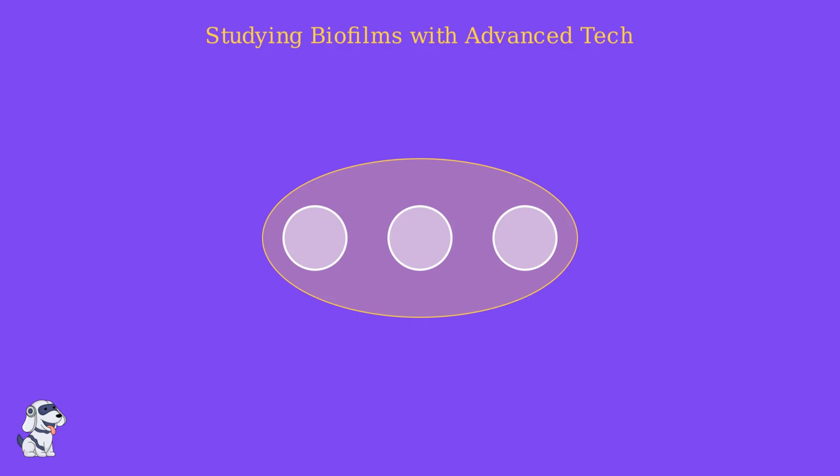These unique shapes are essential to understand, as they facilitate the development of antibiotic resistance. Without destroying these structures, we gain vital information. Mapping them allows clinicians to observe how resistance forms, ultimately helping us fight these stubborn infections.